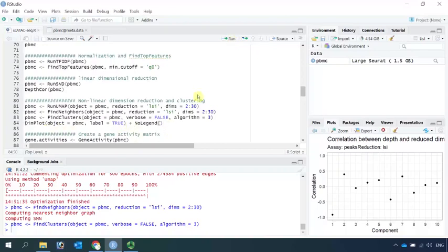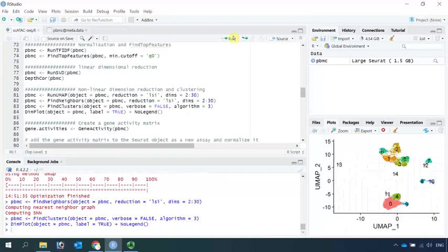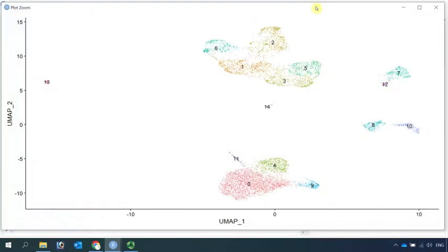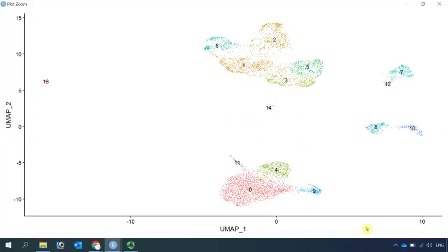Let's have a look at the cell clusters. We can zoom in. We have 15 cell clusters in this data set. I am going to stop for today's video demonstration.